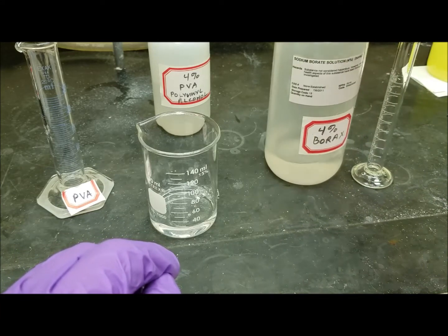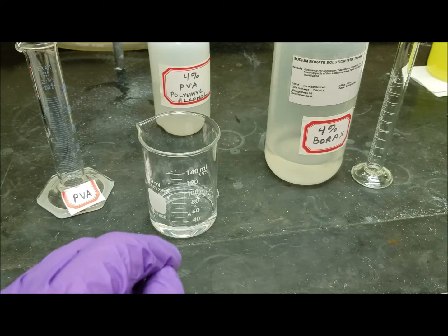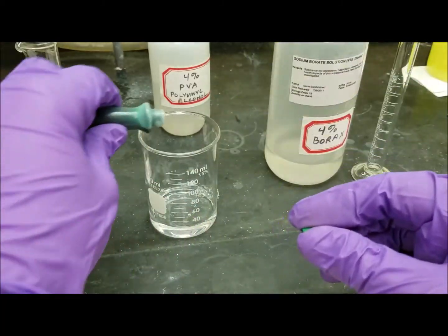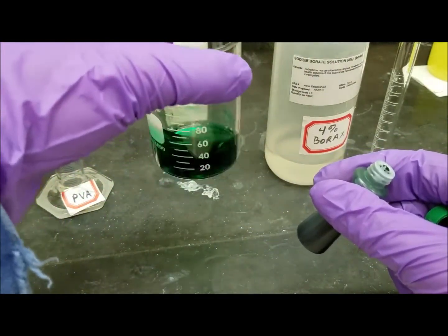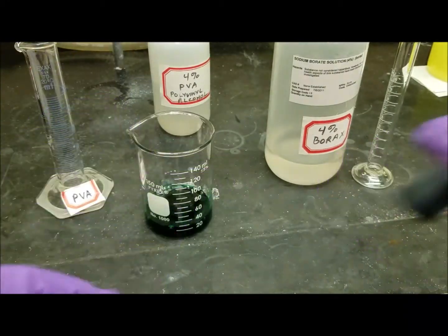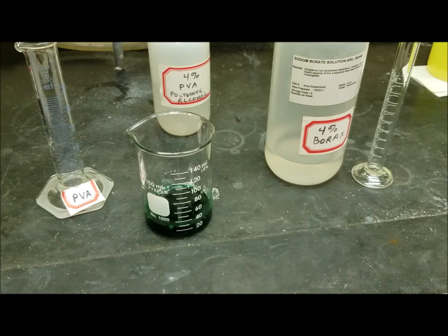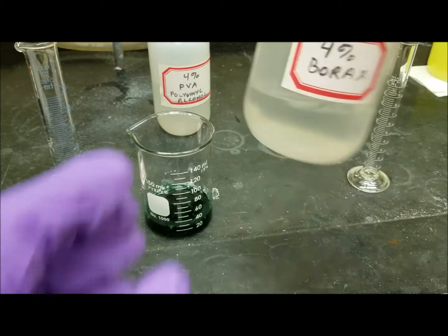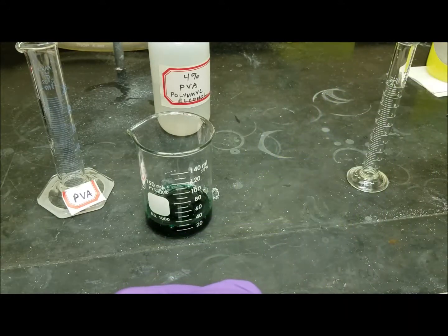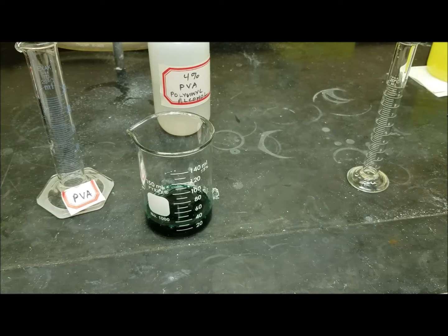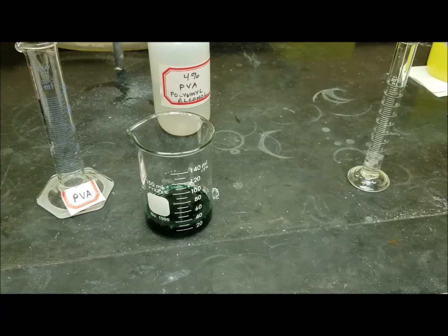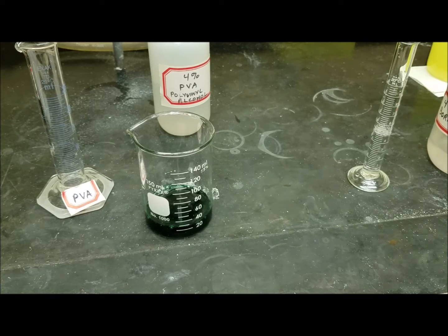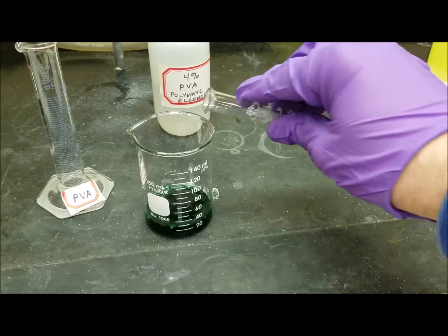Now when we add, we're going to add 10 milliliters of borax to that, but first let's make this a little more colorful. So we're going to add some green food coloring to this. And then we're going to add our 4% borax, 10 milliliters, I think, or was it 5? 5 milliliters.